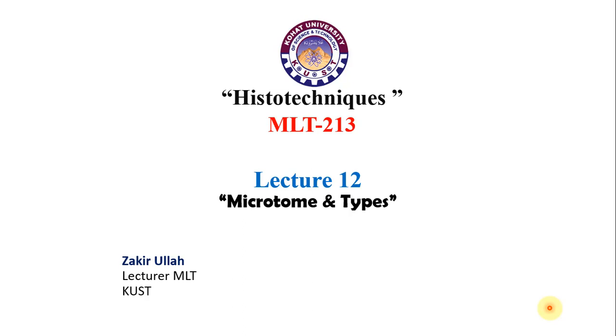This is lecture number 12 about the microtome and its types.